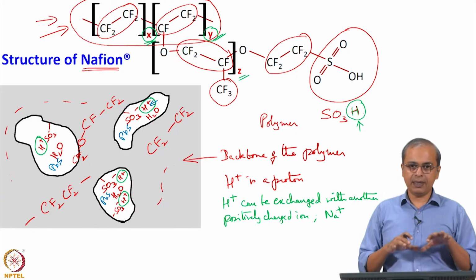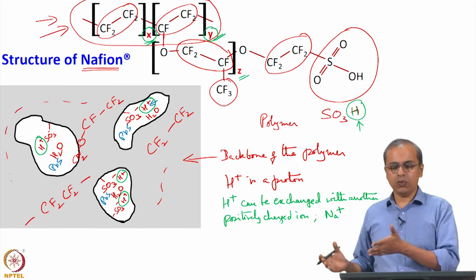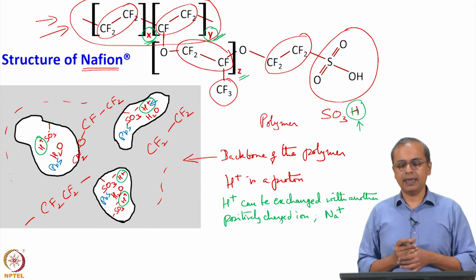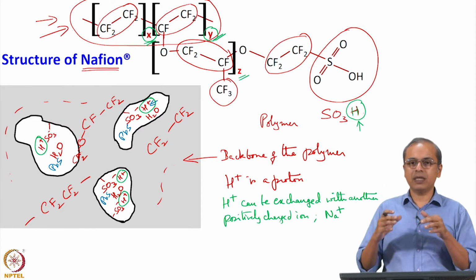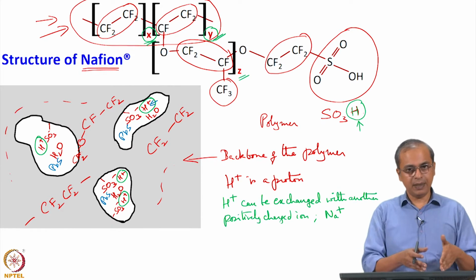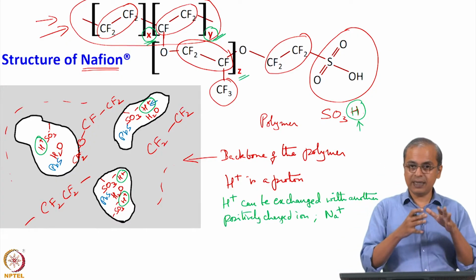Based on the time of immersion, the amount of lead sulphide that has gotten into these pores changes, and naturally the longer you wait, you get more lead inside the material, and this is a factor that we can use to control the amount of lead in the membrane, and therefore the crystal size of the lead sulphide that is formed.